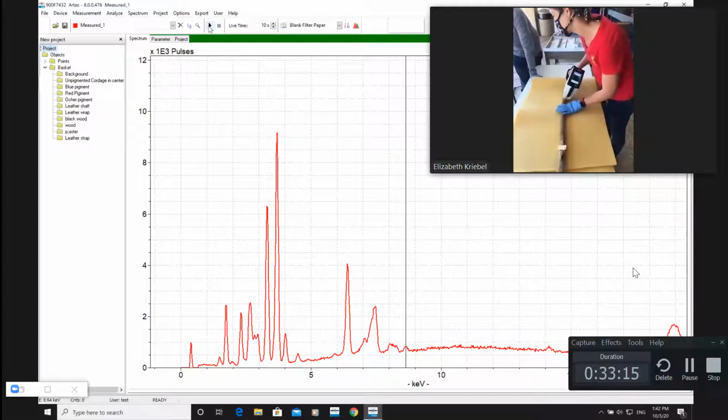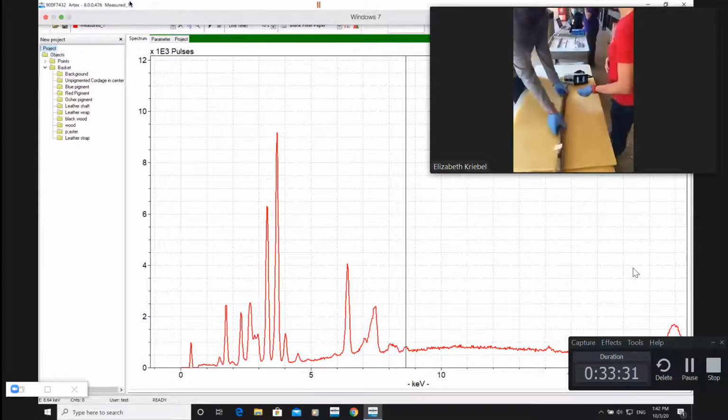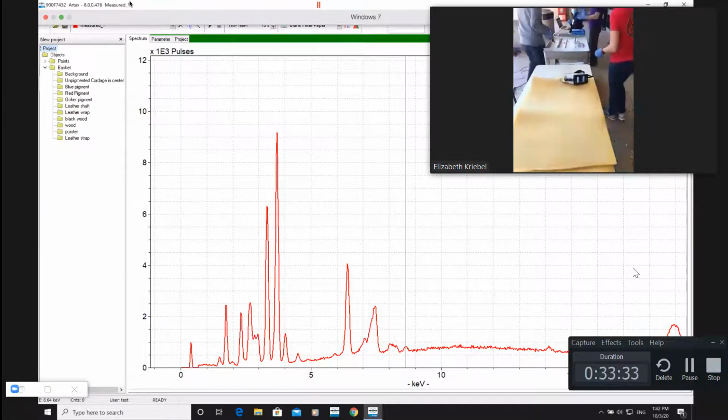Yeah, this is wood. There's no salt, just like before, no salt wash. Interesting. A lot of calcium, potassium, silicates, but no plaster, no mixed plaster in. No attachments on this. No, nothing like that. Okay, so yeah, no lead or mercury either. This is perfectly fine. Okay, great. That's easy.